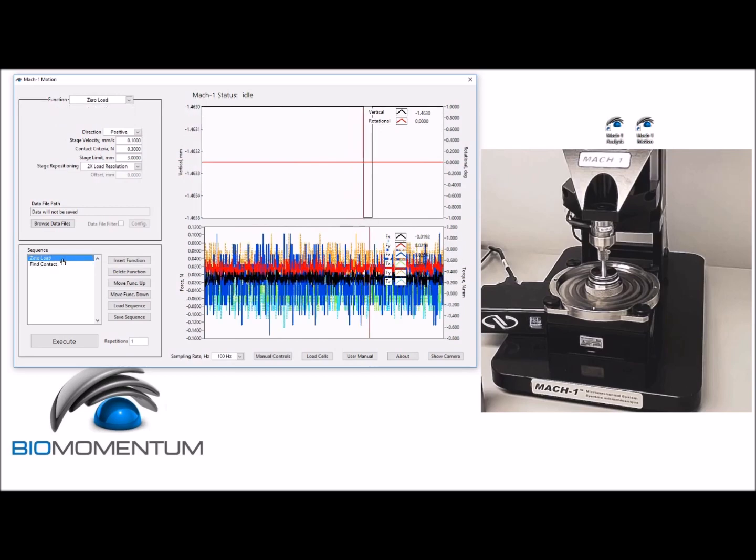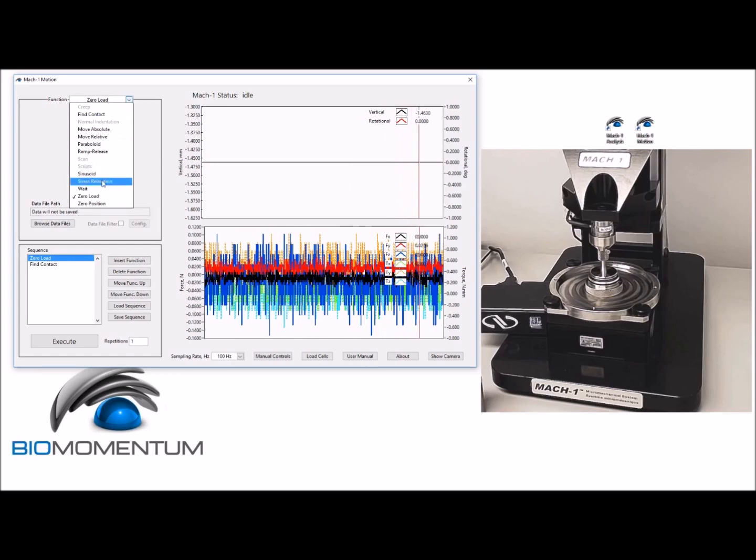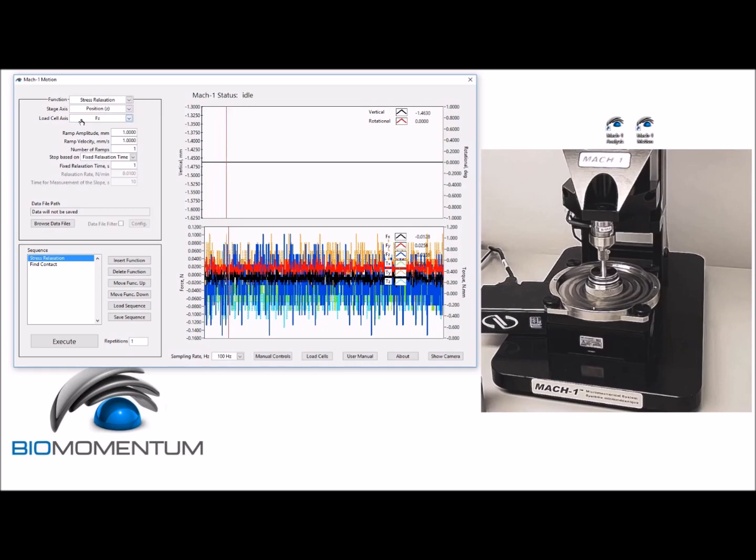With the position Z as a stage axis and a force in the Z direction as the load cell axis, with a ramp amplitude of 10 percent of the sample thickness, which corresponds to 0.1463 millimeter.